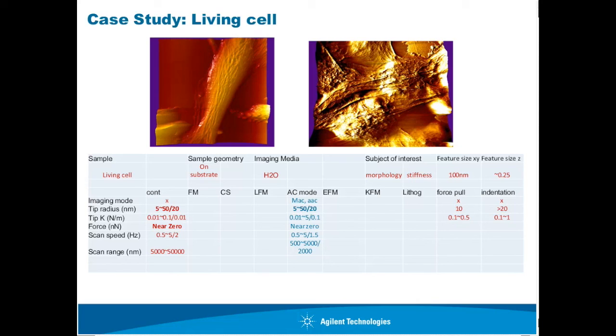Thank you. Grain boundary-like defects are difficult to identify with rough surface scans. The roughness of the surface is roughly 20 angstrom. So what are the key parameters in leveling the image?